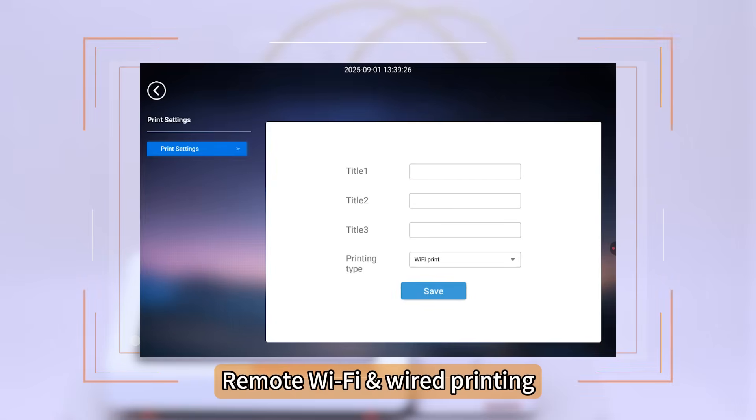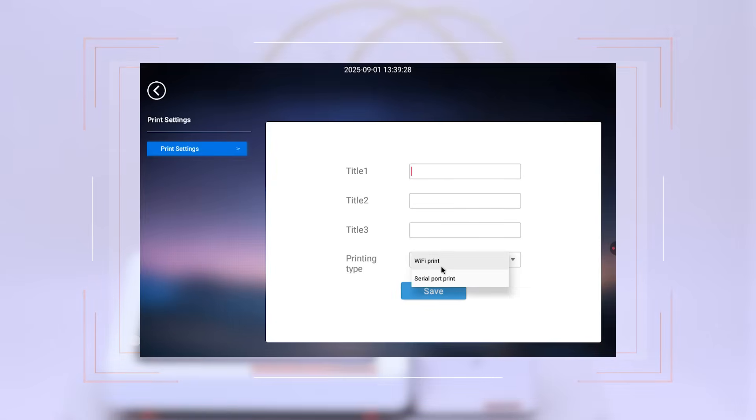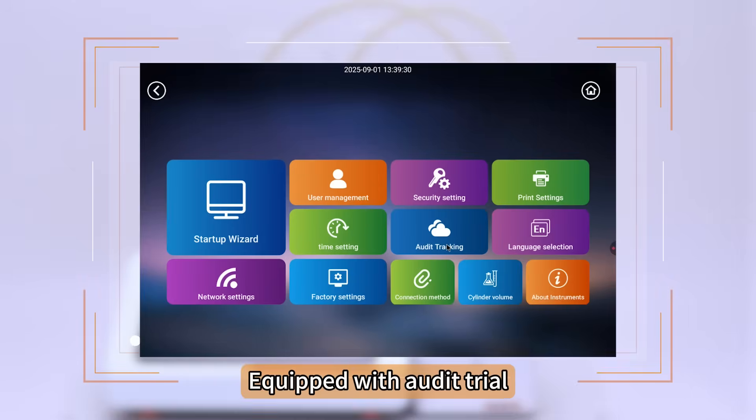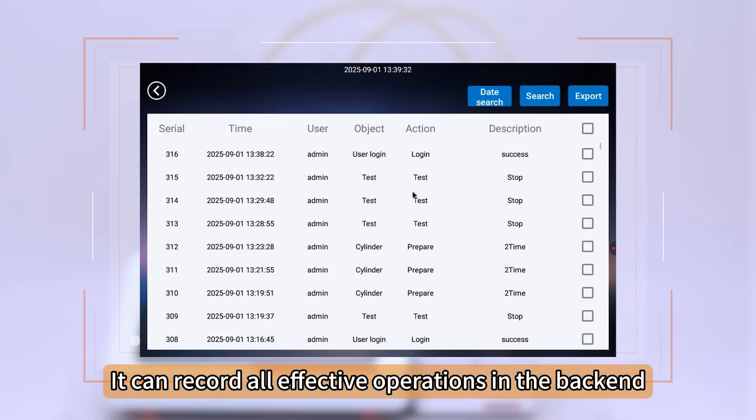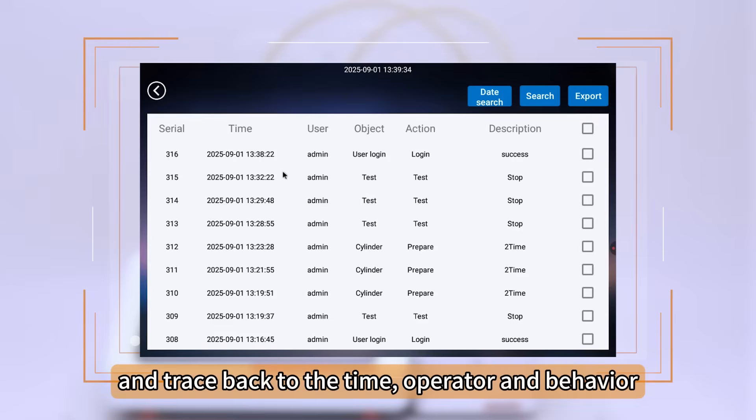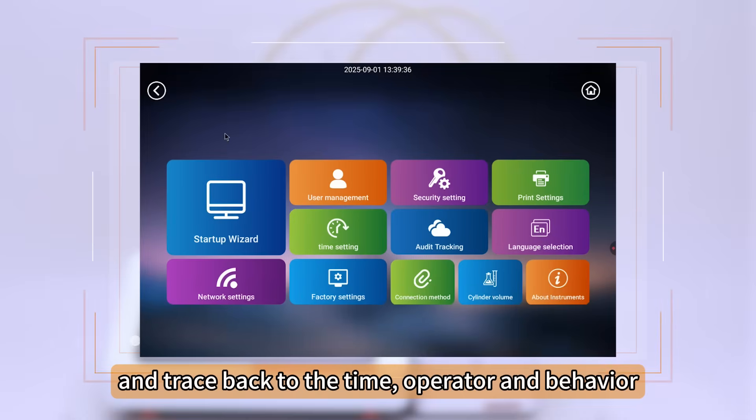Remote Wi-Fi and wired printing capabilities. Equipped with Audit Trail, it can record all effective operations in the back-end and trace back to the time, operator, and behavior.